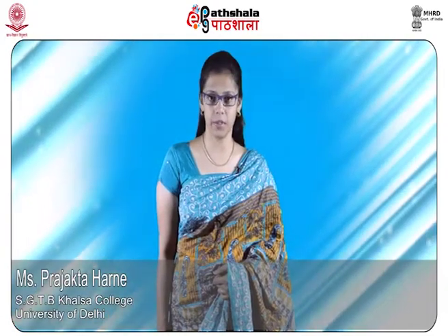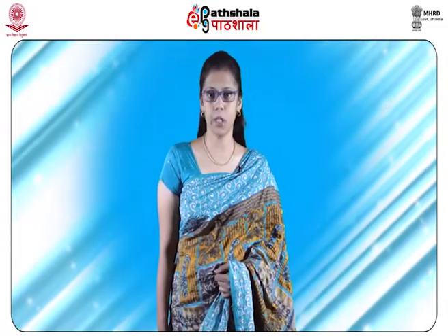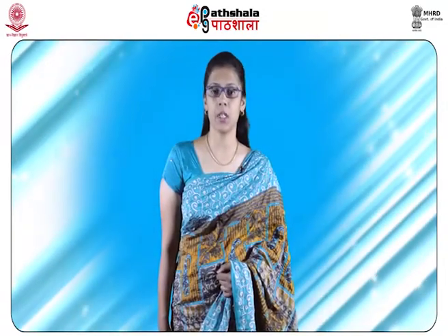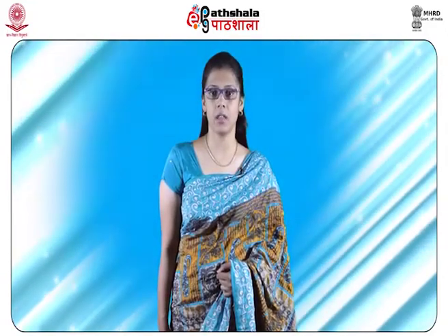Learning outcomes. After studying this module, you shall be able to know what is dye, what is the composition of dye, what are the various types of dye, and what are the methods for dye analysis.